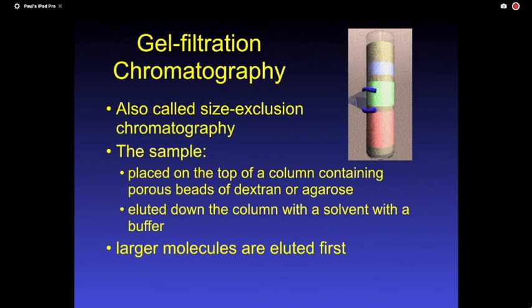And here's the problem. Your protein mixture starts off in a buffer solution that looks like water, clear, and it goes through all of this, and all of your fractions are clear. You don't know if it's actually separated because you don't see color until you do analysis. So you have to analyze every fraction to see if there's protein there or not. What you hope to see is fractions that have no protein, and then fractions that have a protein, and it will produce a peak. If you plot the fractions versus concentration, you have a peak of your first protein and come all the way down and show no protein.